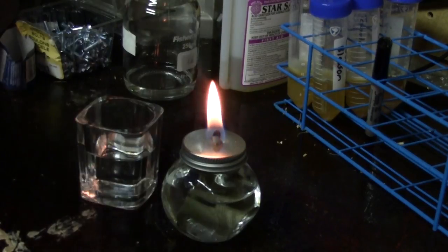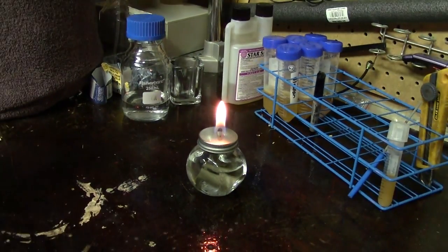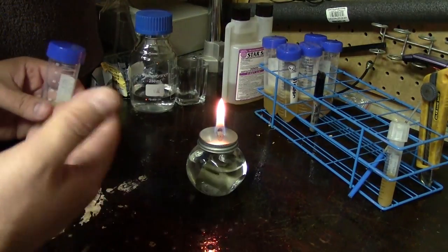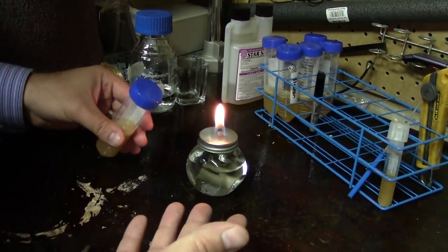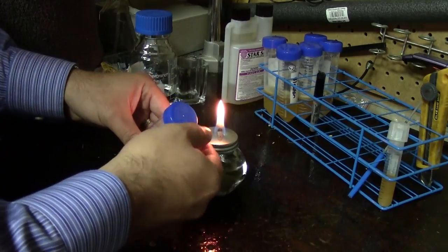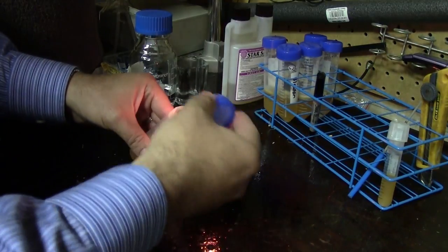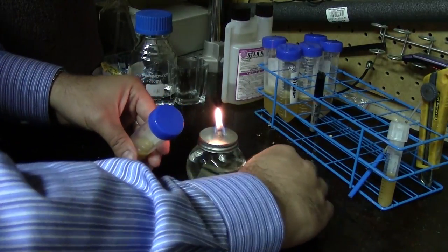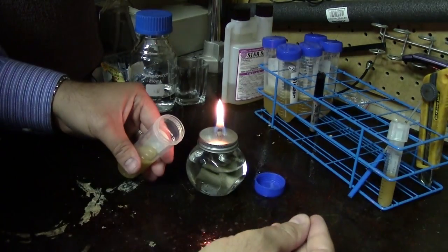The next part of aseptic technique is working with tubes around the flame. The flame is really important here because it allows us to open a tube and put stuff in or take stuff out while keeping the inside clean and sterile. You want to work as close to the flame as is safe — here I'm just a few inches away. When you take the lid off, try to keep it in your hands so you can immediately put it back, but if you have to put it down, place it as close to the flame as possible somewhere you won't be reaching over top of.